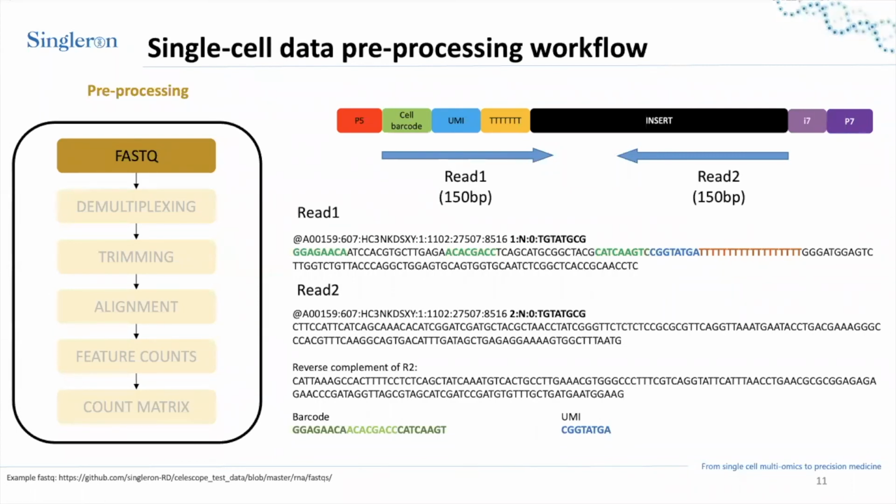Is the barcode sequence divided into 3 sections? If so, why? Here in this platform, it is divided into 3 sections. The main reason is first to enable the bead to continue to synthesize by having linker sequences, so there is a stronger affinity with regard to 3 different components of the barcode.